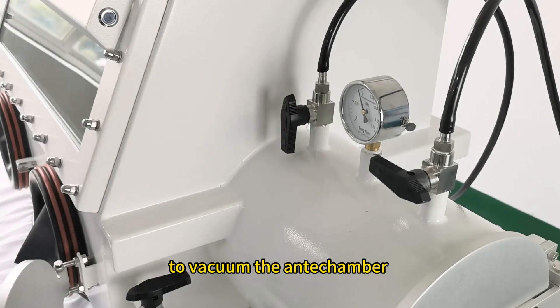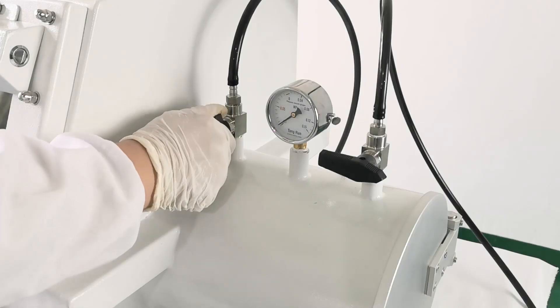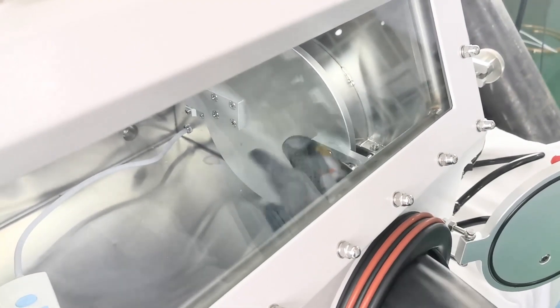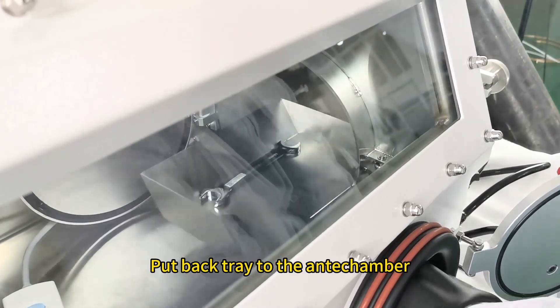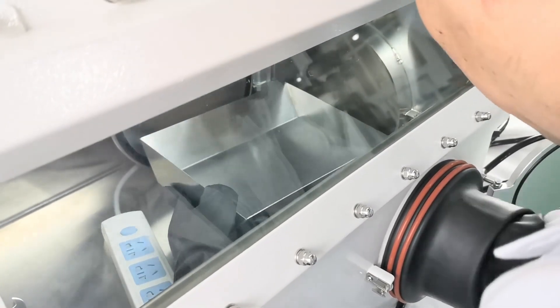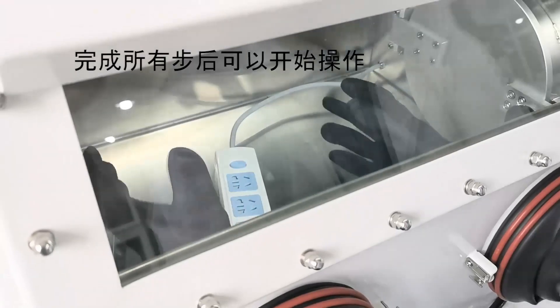To vacuum the antechamber, refill the gas and repeat the operation for several cycles. Open the inner door, take out the item into the glovebox, put the tray back into the antechamber, then close the inner door.